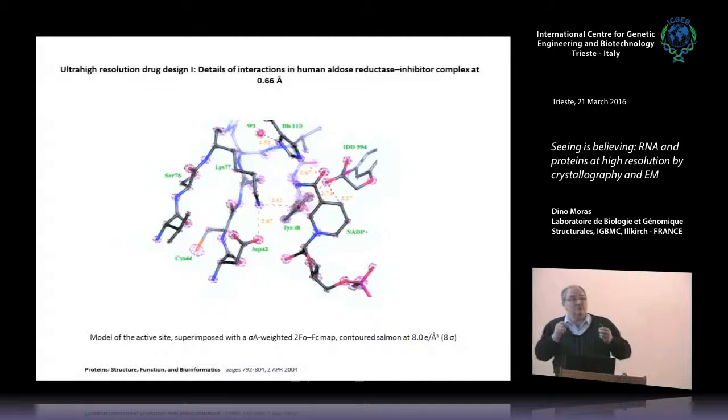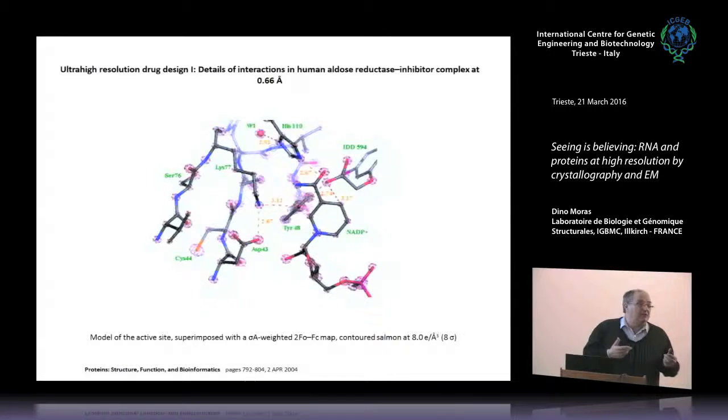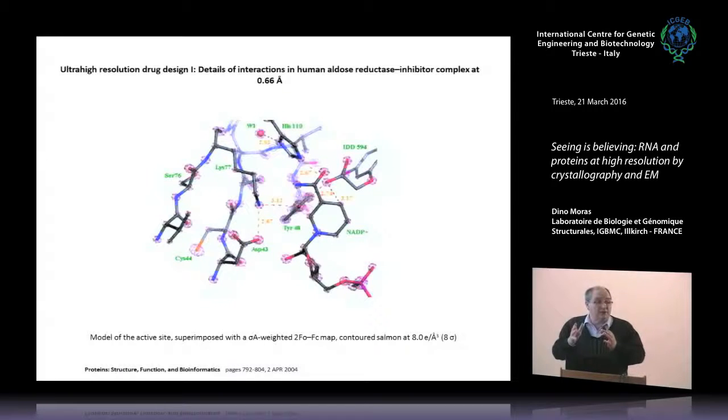But when you are interested in molecular chemistry, this is from an enzyme, aldose reductase, which is rather important for medical applications. But I'm not going to talk about that. You want the most accurate structure in a meaningful conformational state. By meaningful, I mean you should have it with different substrates and see what makes the difference. If you know what these substrates do, for example, one would be an inhibitor and another one not, an agonist, then you can compare what's different.